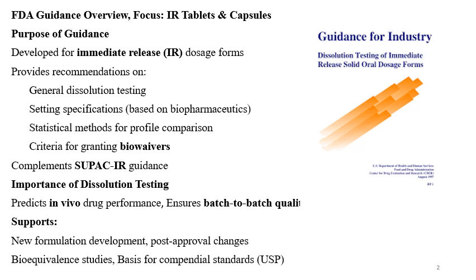The guidance provides recommendations on general dissolution testing, how the dissolution testing is to be performed, setting specifications for the dissolution based on the biopharmaceutics, then statistical methods for the profile comparison, and criteria for granting the biowaivers. Also, this guideline complements the SUPAC IR guidance.